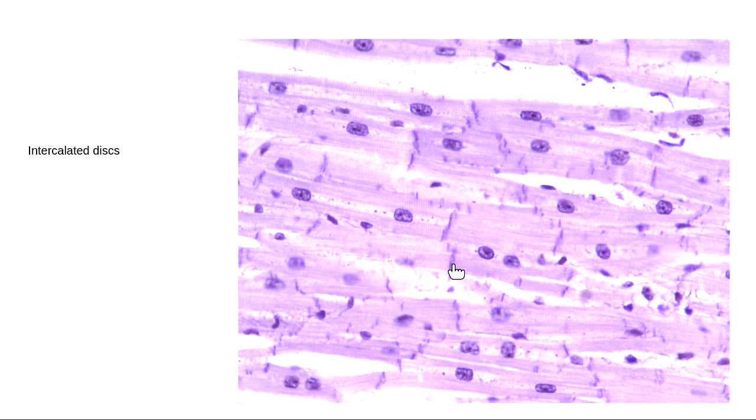The other thing I'll mention too is with our cardiac muscle tissue. I know it's a little bit bleached out right here, but this area right here, and we have a little bit more up here, these spaces on cardiac muscle tissue slides are actually filled with adipose. So if you see tissue that has open spaces in between those muscle cells, that would be places where we actually have adipose tissue that's in with it.